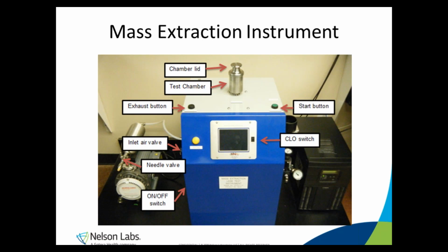You can see the test chamber on top of the instrument. This particular chamber is designed for vials. There's also a pump to the left. There's a display in the center of the unit, which shows all the critical test information, as well as the mass flow graph. Of course, this machine's off, so that shows nothing right now.